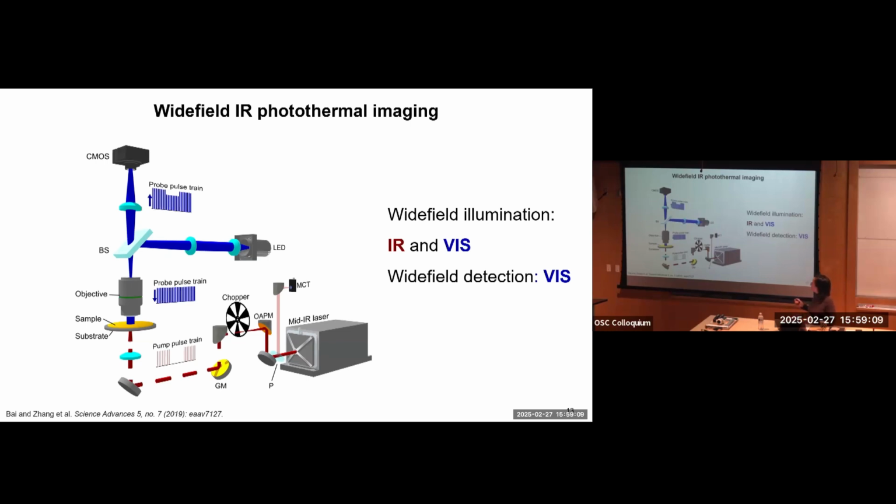Yeah. So the bottom part is the infrared light beam path. We have our IR light modulated with a rotating chopper, and then you can see after the chopper we have a pulse train like this. Sometimes we have IR pulse on, we will call it hot frame, and the other region we don't have IR pulse, we will call it cold frame. When the IR pulse is on, for hot frames it will cause the sample reflected light to increase.